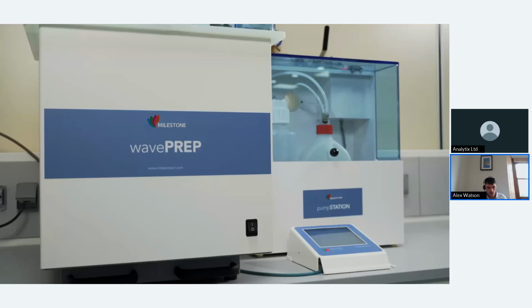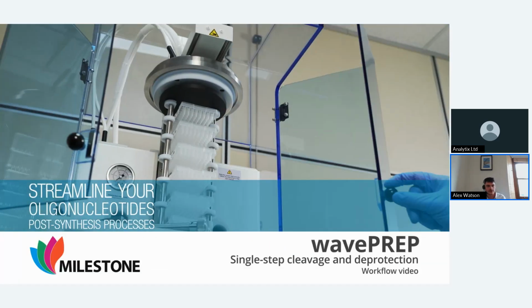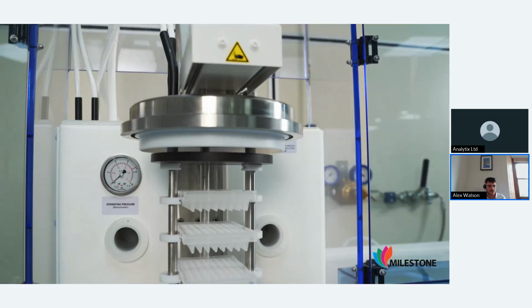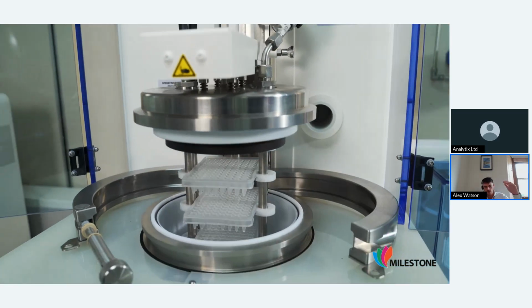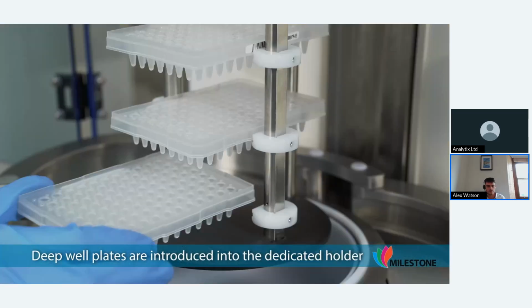I've now just got a quick video before we look more into wave prep. I think it's a nice way of just visualizing the system more so that when I talk about it, it makes a little bit more sense. So here you can see the oligos that automatically brought into our cleavage and deprotection reactor.